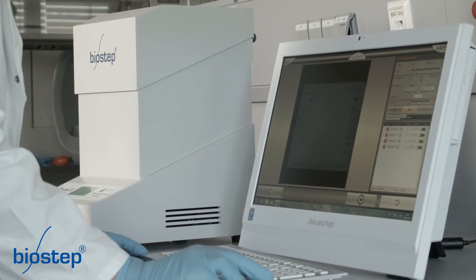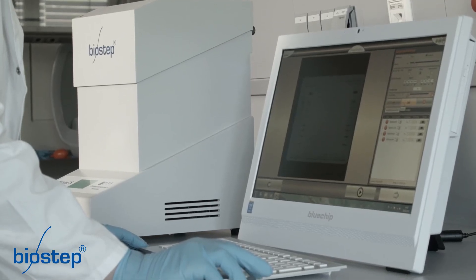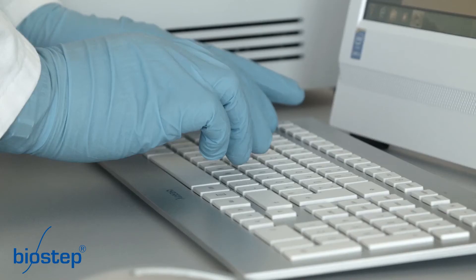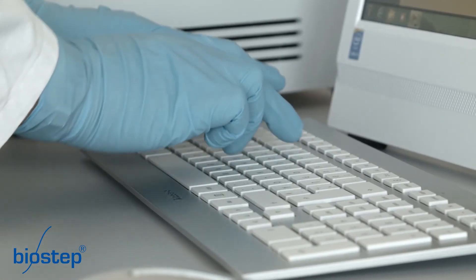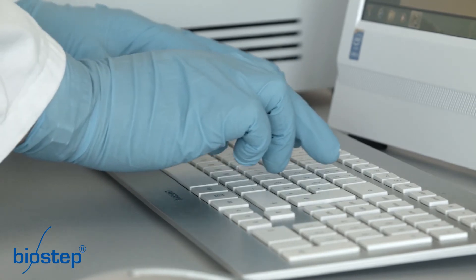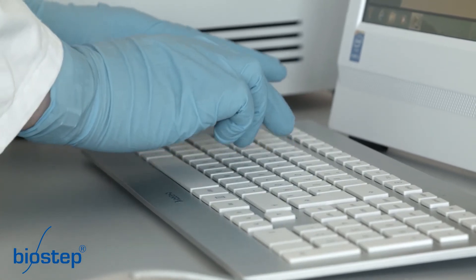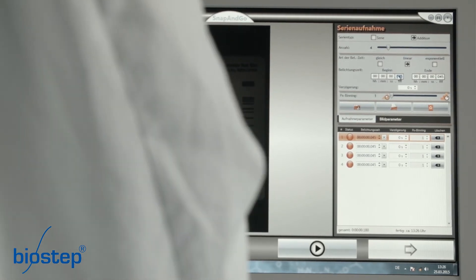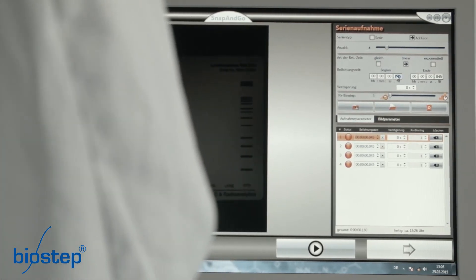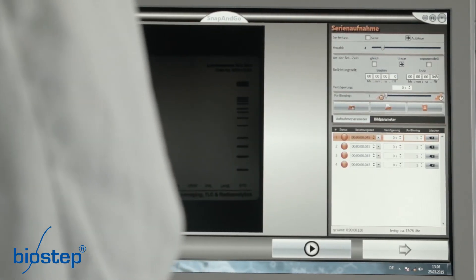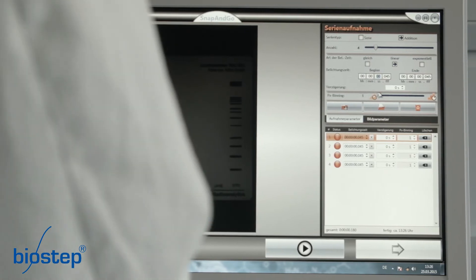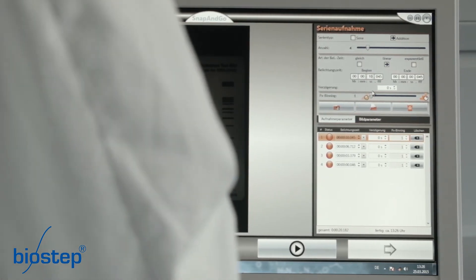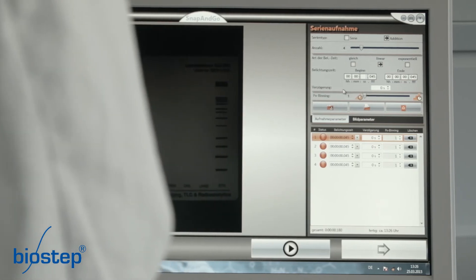You can acquire up to 20 images. The settings can be saved as methods and loaded. The images to be captured are listed and settings such as exposure time, binning and delay can be set individually. We choose a linear increase of the exposure time and four images. The exposure time should be 10 seconds max. The software calculates the exposure time for each image automatically.